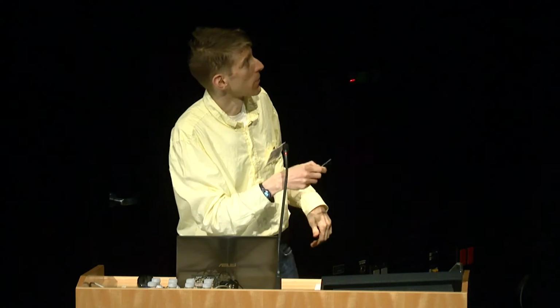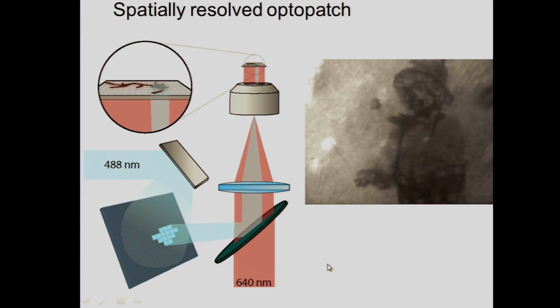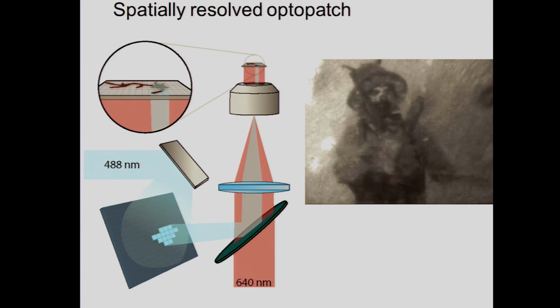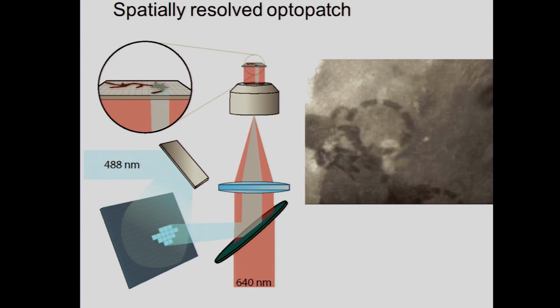Just to demonstrate that this works, I took a fluorescent film, just fluorescent plastic beads, and projected a video from YouTube onto these beads inside the microscope, and then recorded the view inside the microscope. And so that's what this looks like. So this is a video of a clown taken inside the microscope. And a single cell would be about this big on this field of view. Okay? So you can really stimulate in any pattern of space and time that you like.